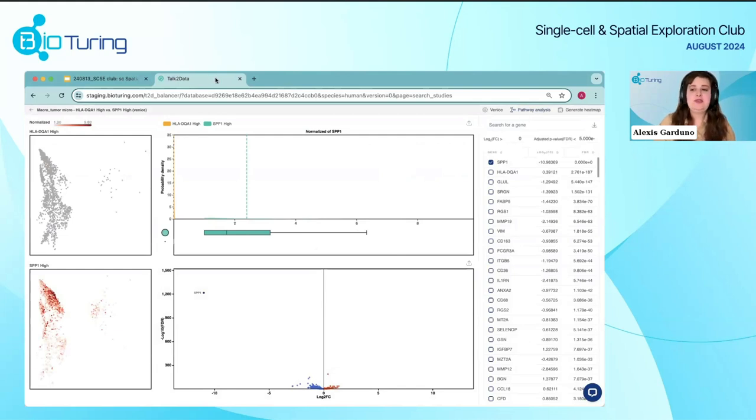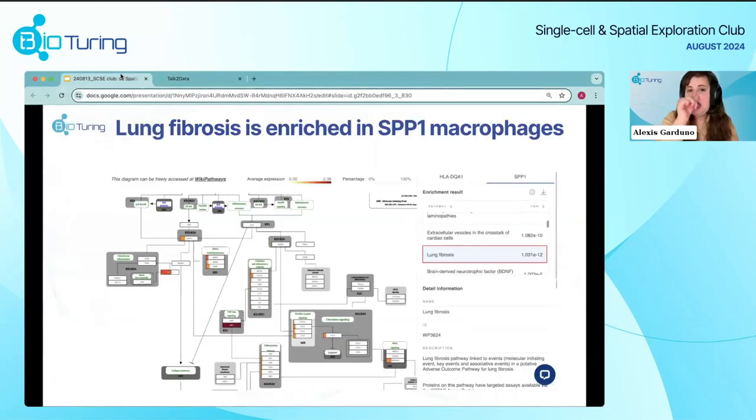And this will show us some information relating to how the upregulation of the metastasis or the immunosuppressive genes play a pivotal role in these SPP1 macrophages and specifically in promoting lung cancer, since we are using a CosMx lung cancer data set. So we want to gather further insights into these pathways. So if I go into the functionality of the pathway analysis in the DGE feature, we get some more information into the different pathways that have a functional role.